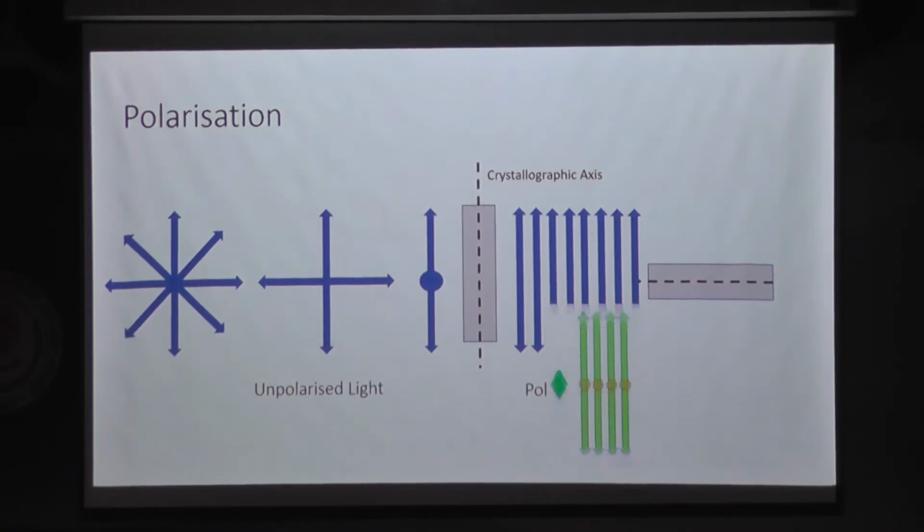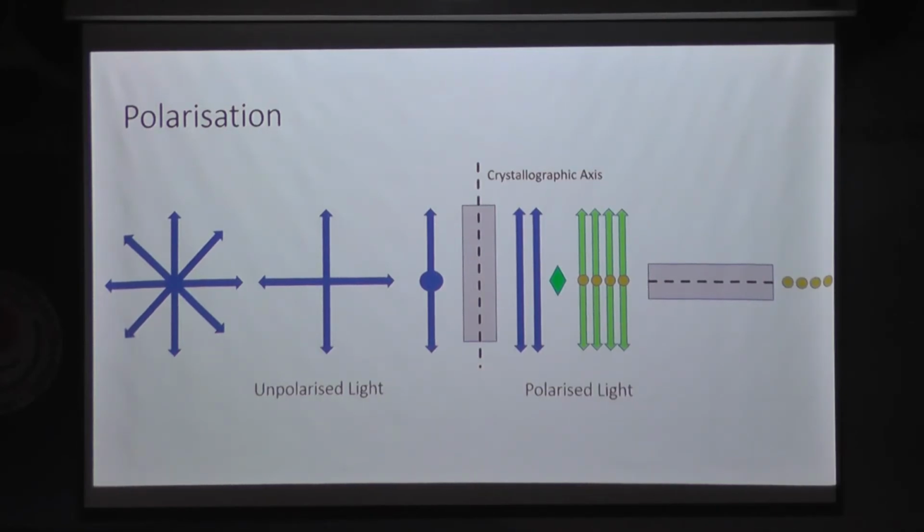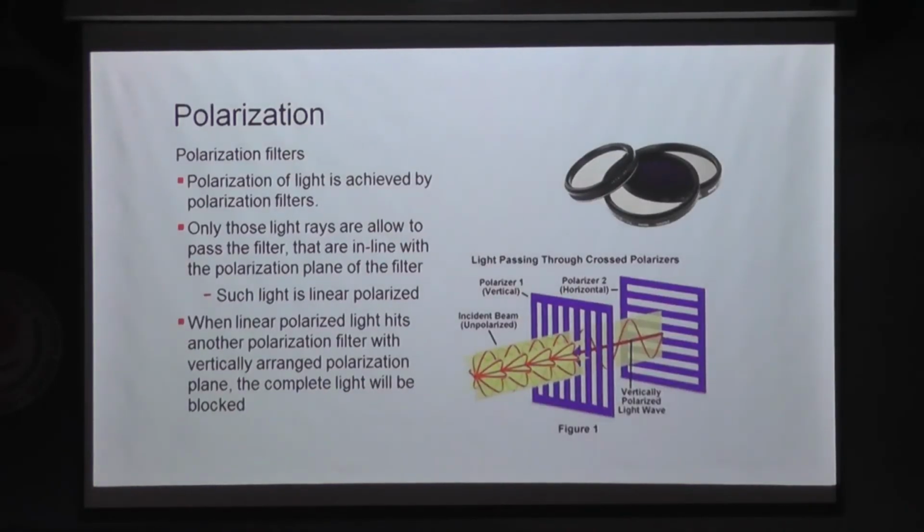But at the same time, when I immediately place a crystal or a specimen which is birefringent, which has the property of birefringence, it gives me light again. When this unpolarized light passes through this crystal, it is giving these lights. So all those which are horizontally placed are coming out of these optics. This principle is called polarization, and it gives good contrast also.